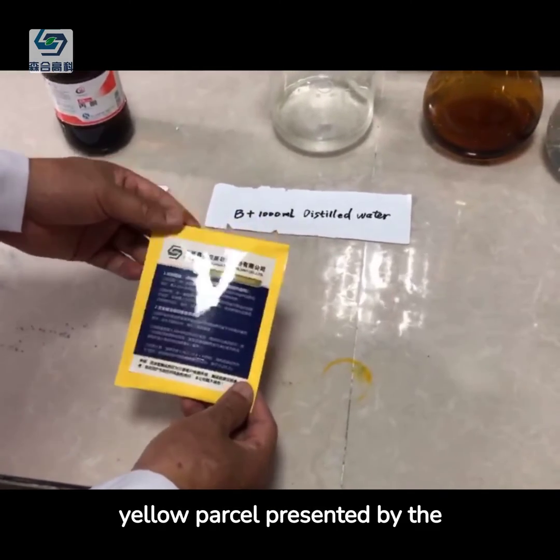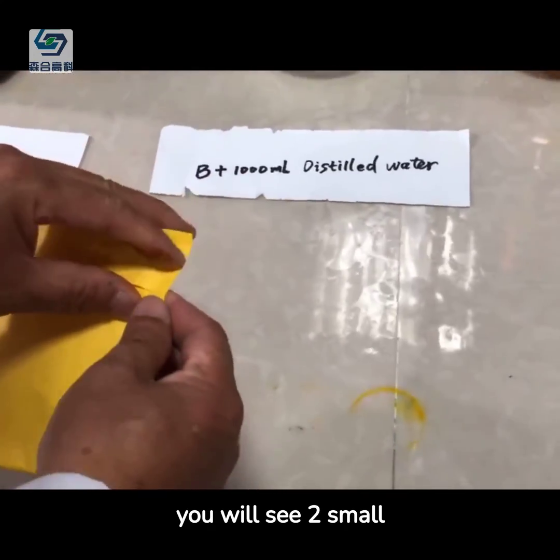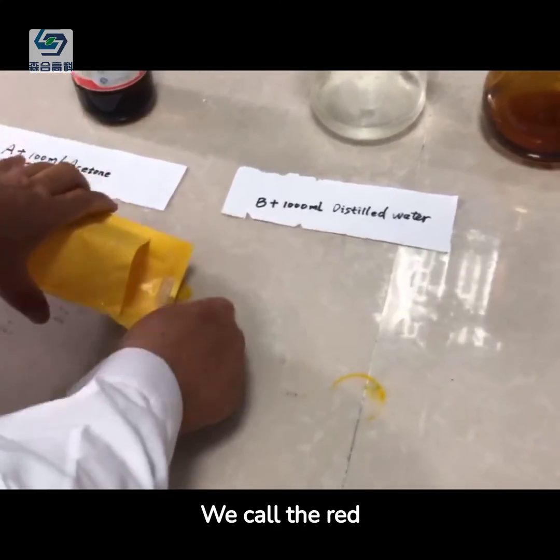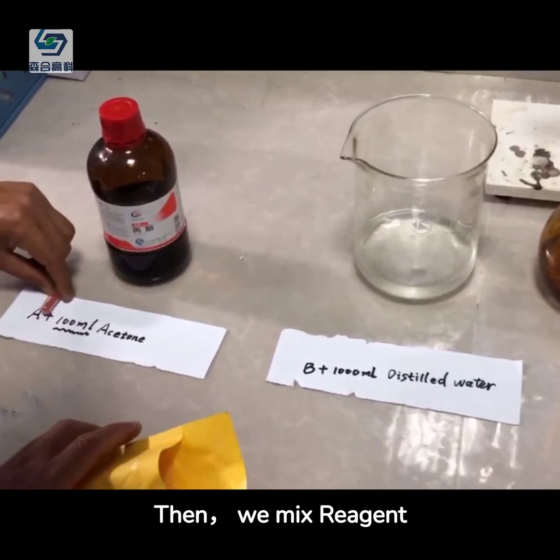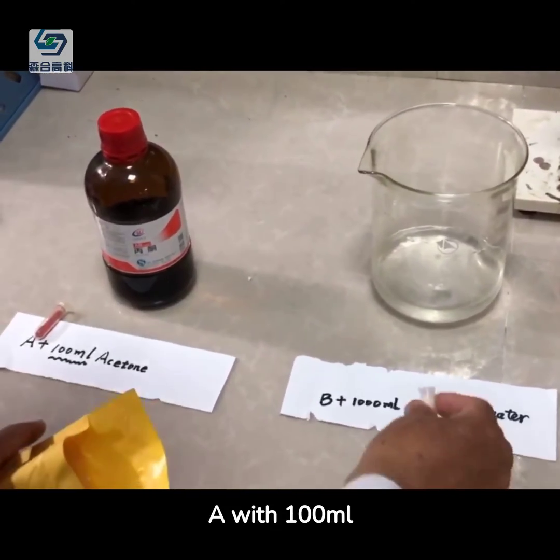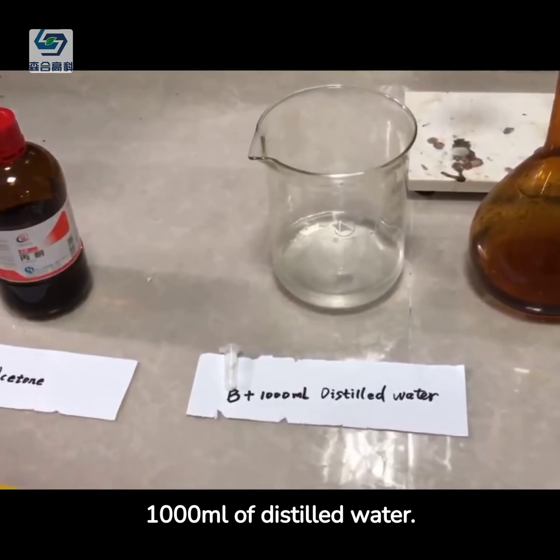Now, open the small yellow parcel provided by the manufacturer, and you will see two small test tubes of powder reagent. We call the red one reagent A, and the white one reagent B. Then we mix reagent A with 100 milliliters of acetone, and reagent B with 1,000 milliliters of distilled water.